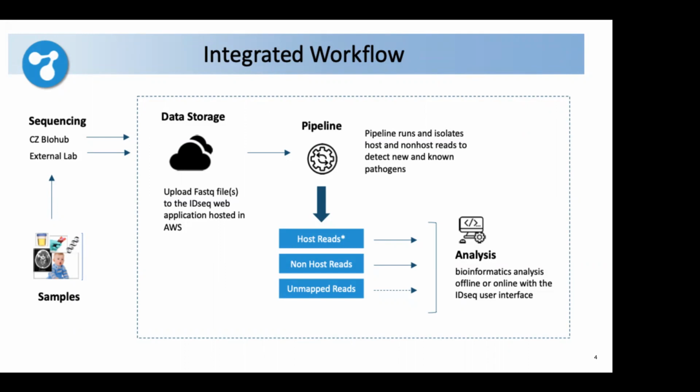Okay. The last thing that I wanted to say before actually starting the demo is, just highlighting again that IDseq is a tool intended for research or academic use, and our terms don't allow you to take the data and use it for monetary gains. So just highlighting that here as something to be aware of with this tool.